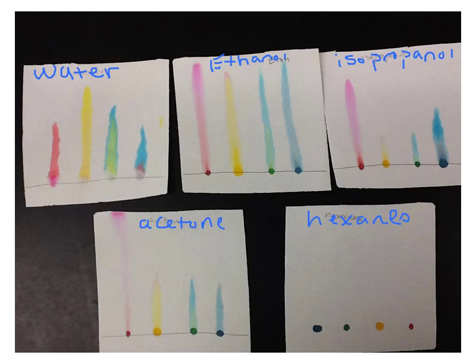Alright, so what you guys are seeing here is an example of all the chromatography. So you can see I took each one of the solvents there. So here's your red, obviously your yellow, green, and blue. And I did it for each one, and then listed above it I also have the solvents that I used, okay? And so remember, when we talk about chromatography, there's a mobile phase and a stationary phase. The mobile phase is what you see on the paper. The paper is your stationary phase, and your mobile phase is the solvent as it moves up, okay?